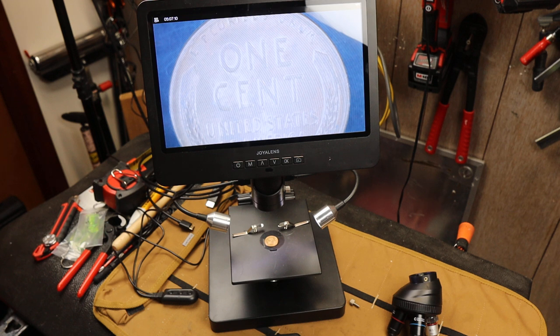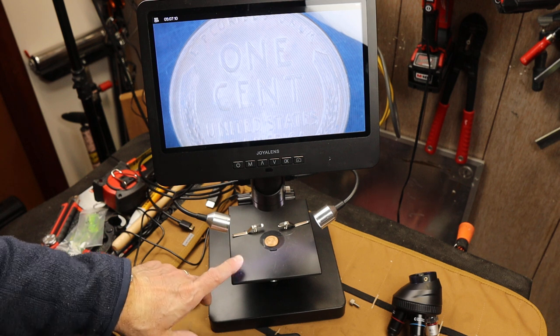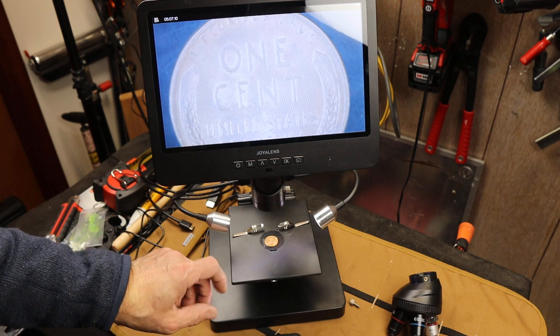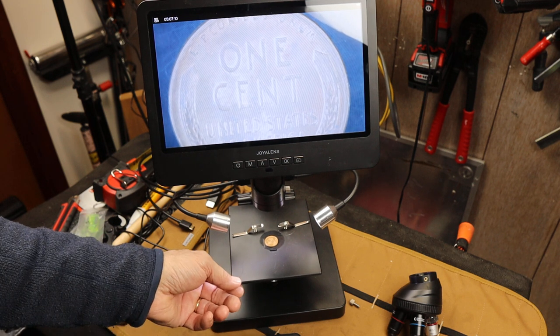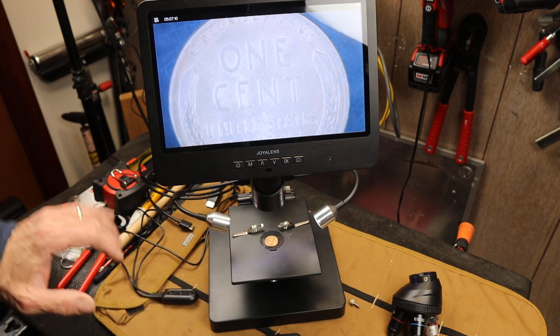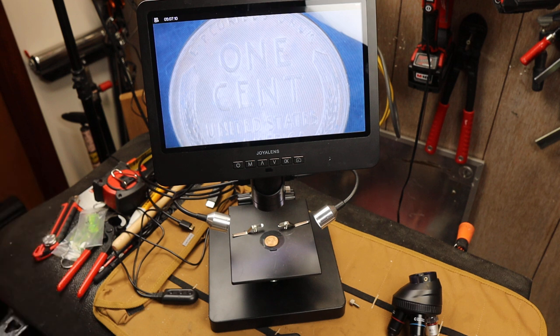It's a very lightweight system. If anything, that would be something to watch. The stage, the base, it's all lightweight, which means it works great, except it's very susceptible to motion, and I'll show you that.